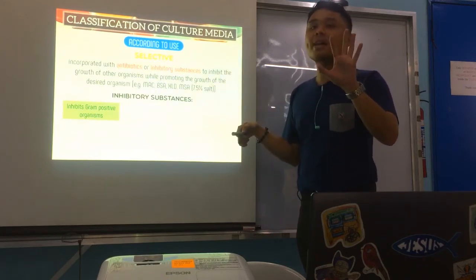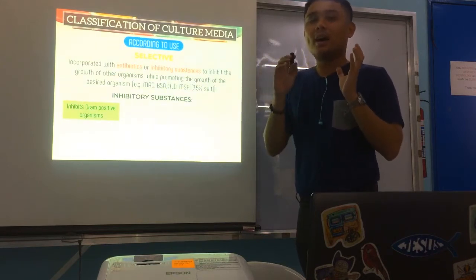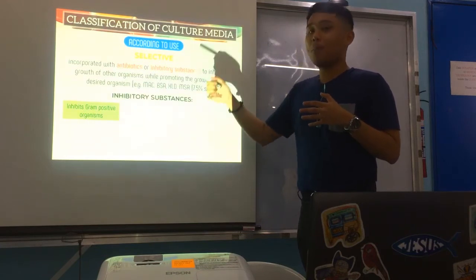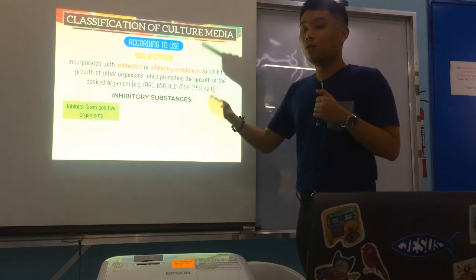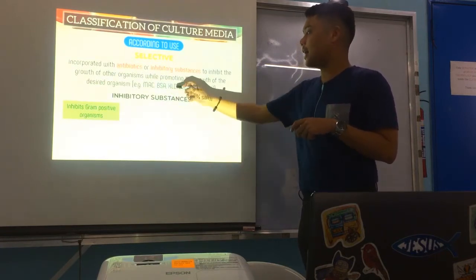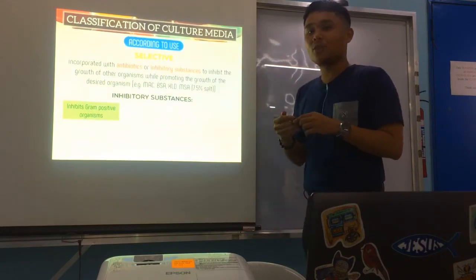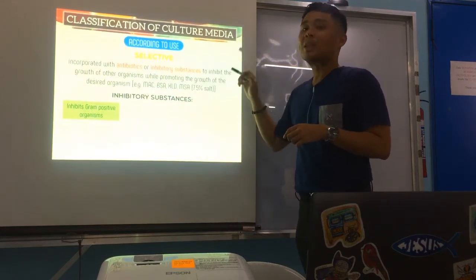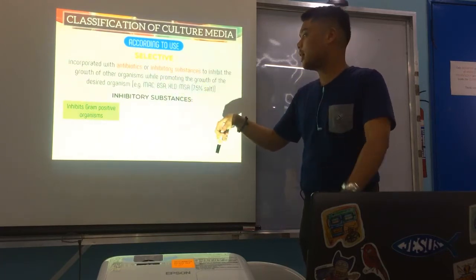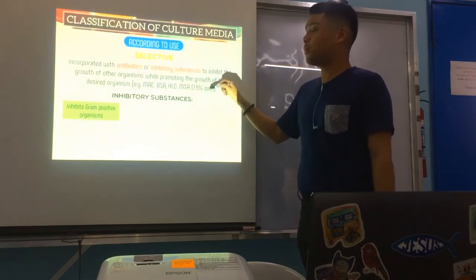Yes, that could be. A culture media can be of mixed types depending on use. It can be selective differential, or selective enrichment, and it depends on the composition and the purpose of the culture media. So you have MAC, MacConkey, BSA, bismuth sulfite agar, XLD, xylose lysine deoxycholate, and MSA, mannitol salt agar with 7.5% salt. Again, this is for gram-negative bacilli in stool culture, don't worry. I'll explain that further there.